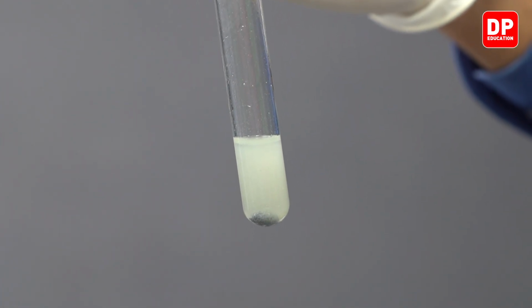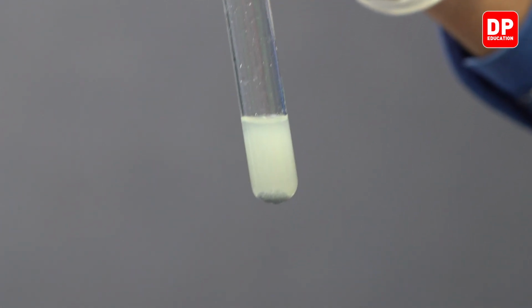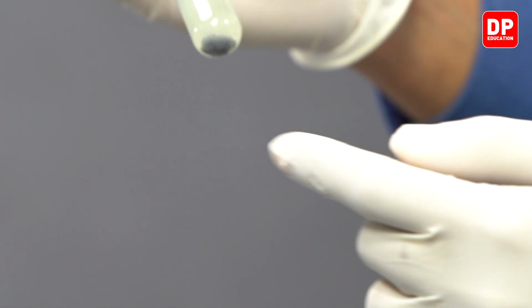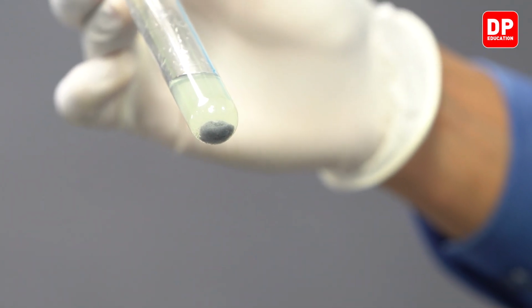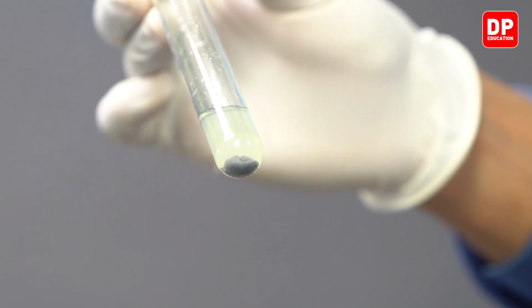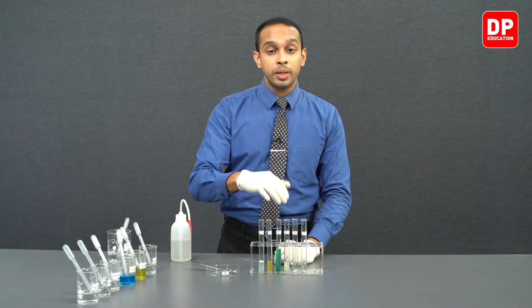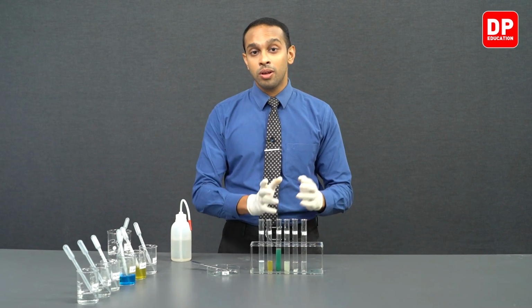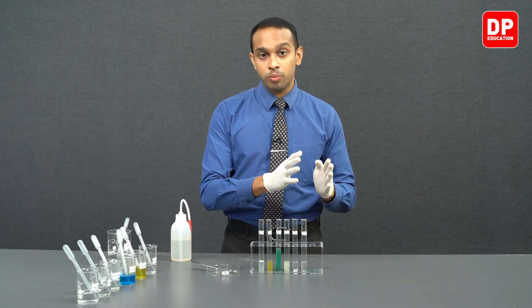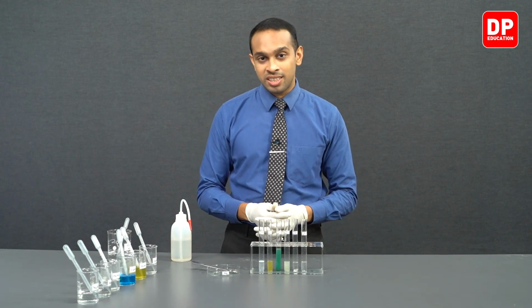So we have over here lead 2+ ions in this medium, and these lead 2+ ions were displaced by the magnesium metal that we added. At the bottom of the test tube, we can observe a slight gray color precipitate. This is the displaced lead metal. Pb2+ aqueous ions got displaced as Pb solid, or lead 2+ got displaced as lead solid, while magnesium metal, or magnesium solid, got oxidized into magnesium 2+ aqueous ions.